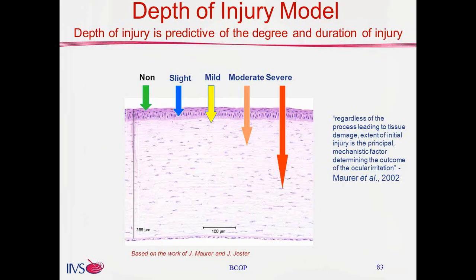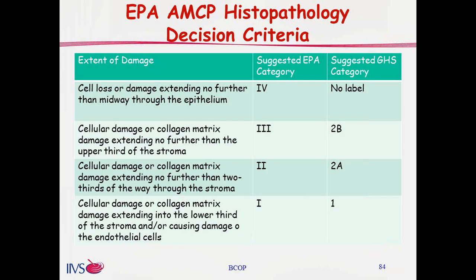Mild to moderate to severe irritants had deeper and more pervasive damage into the cornea, and the depth and nature of those injuries were then predictive of whether there were corneal erosions and whether recovery was likely. Certainly, severe irritants that were penetrating and damaging halfway into the cornea were unlikely to recover in the 21-day test and hence would be labeled as severe.